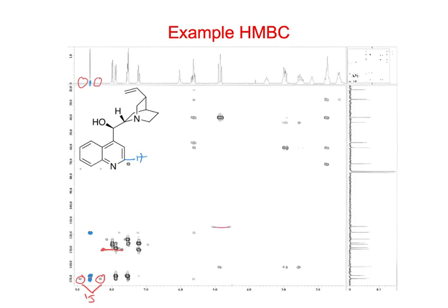These, I think, is a one bond coupling. The one bond couplings show up symmetrically disposed on each side of the proton signals.